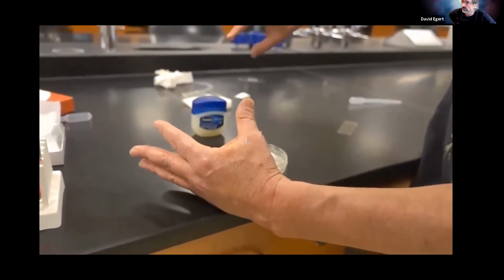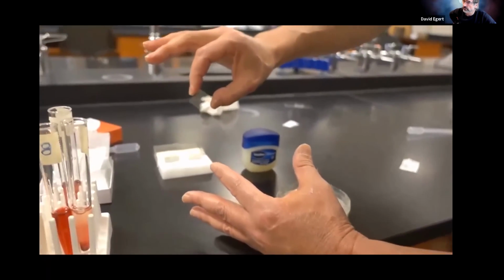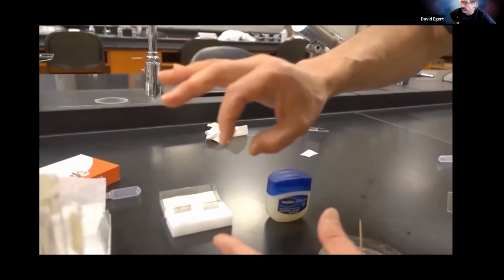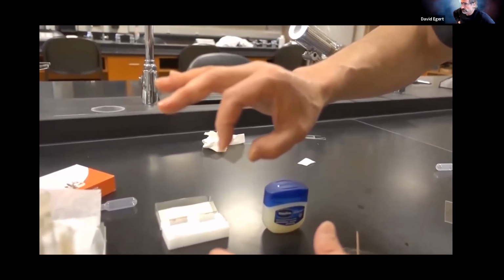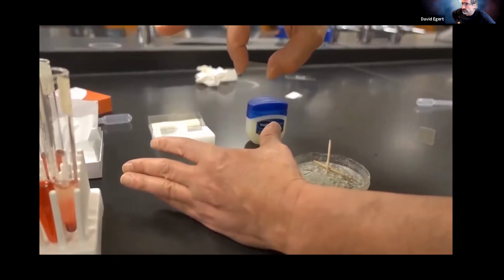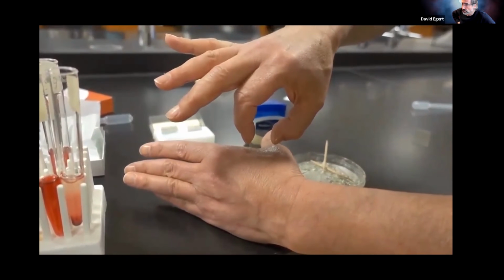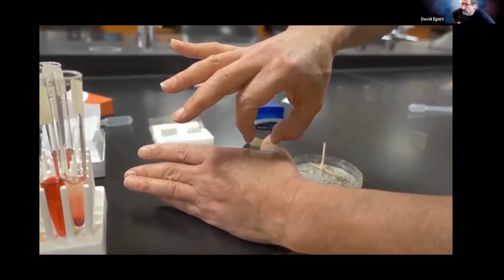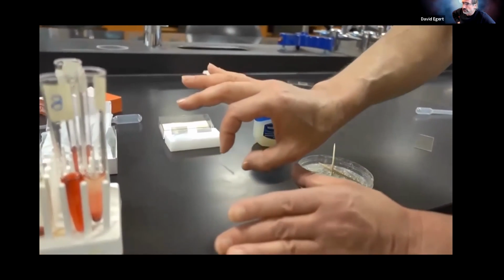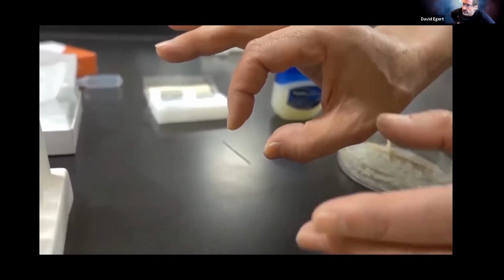Then I am now going to take my cover slip, and this is just very thin glass, and I'm always going to make sure I hold it just by the edges because I don't want to get my fingerprints all over it. And for each of the 4 sides, I'm going to put the side into the Vaseline and just drag it. Maybe it's like about 1/4 of an inch, and, I don't know if you can see that, the Vaseline has created a seal on that one side.